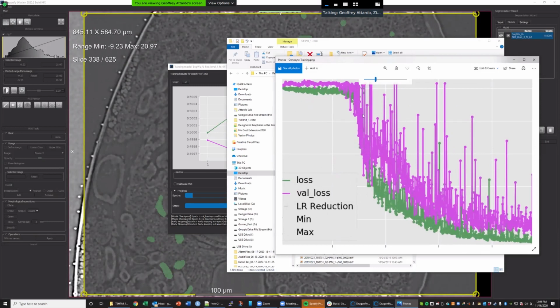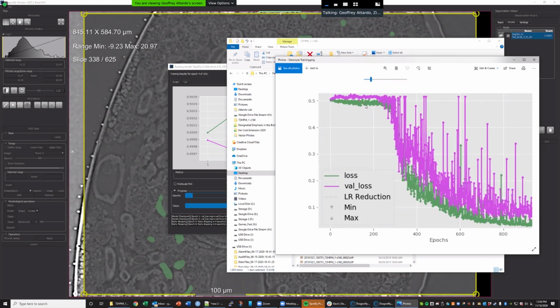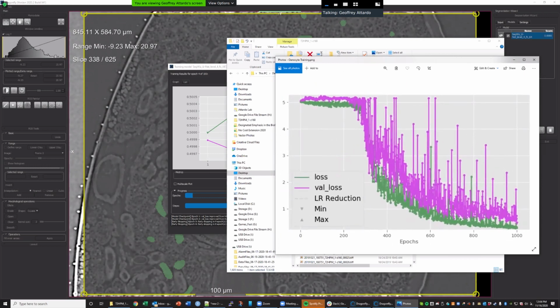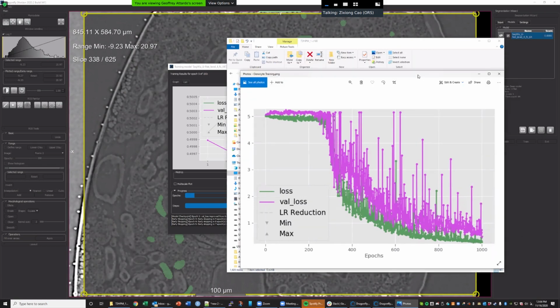A lot of ups and downs and a lot of jumping around. But the trend is still decreasing. It's like once it hit a certain threshold, all of a sudden it started to drop. Personally, I didn't see this happening to me, but I think it's a good case. I think our developers or Mike Marsh, because he has more experience in this, probably have some explanation, and maybe they have seen this before. I will show them the recorded video and discuss with them.